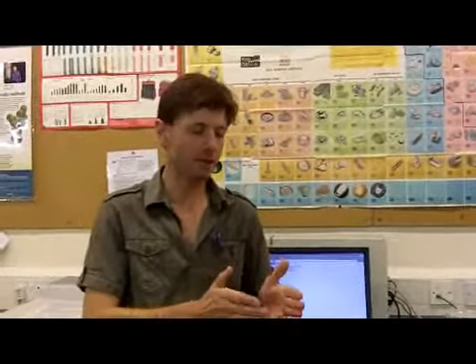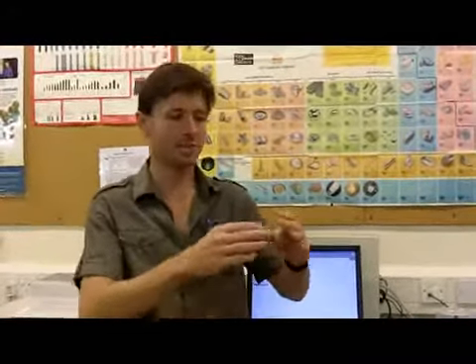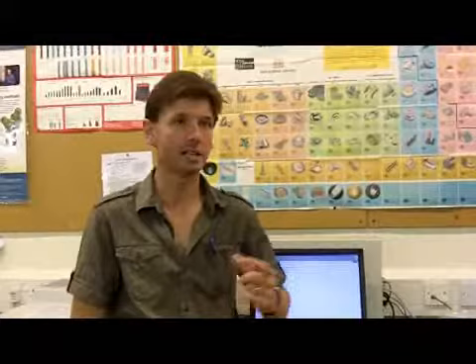That wouldn't be appropriate if your peaks had moved at all, because then the peak might be broader and still have a large area. It would be low, still have a large area, but because it's broad, it's low, and your concentration wouldn't work. But in this case, I know that your peaks are all in one place, and so you can use the height as an effective measure of surface concentration.